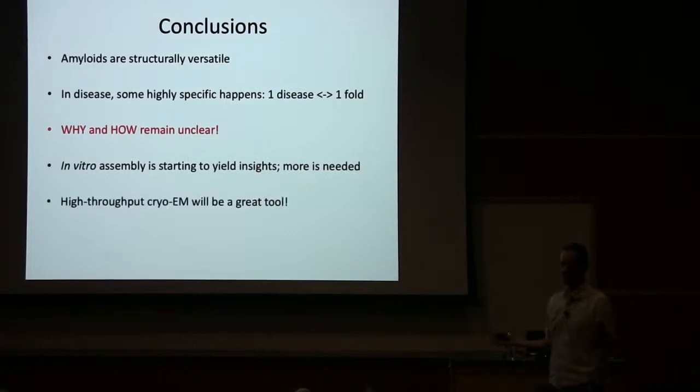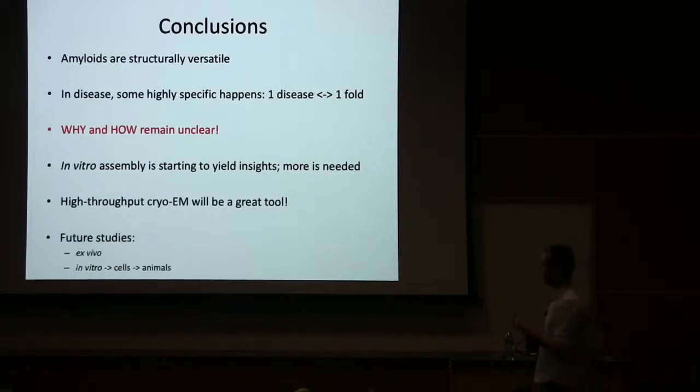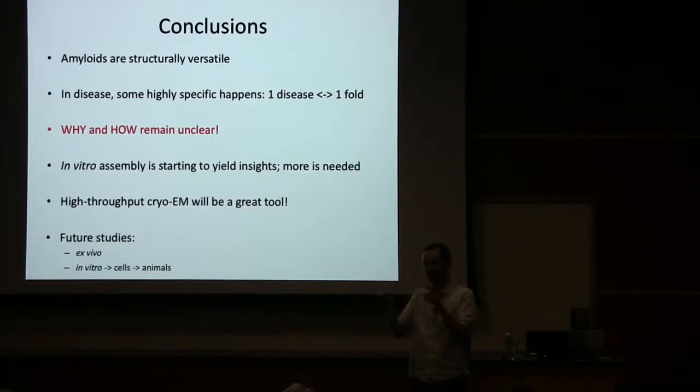And high throughput cryo-EM will continue to be a very important tool. We're also starting to use NMR ourselves now, and I've alluded to some of these things already. So where does this then lead to? What I hope is that from these in vitro studies we'll be able to gain knowledge.